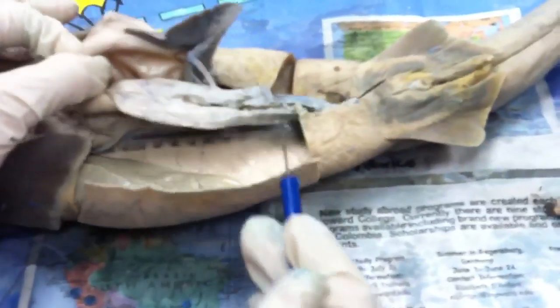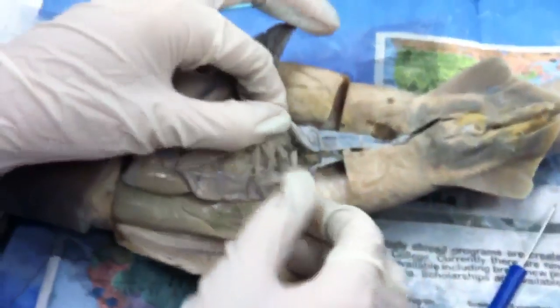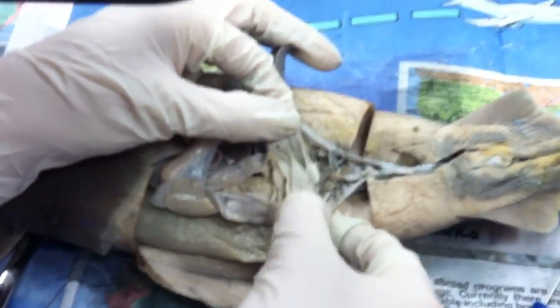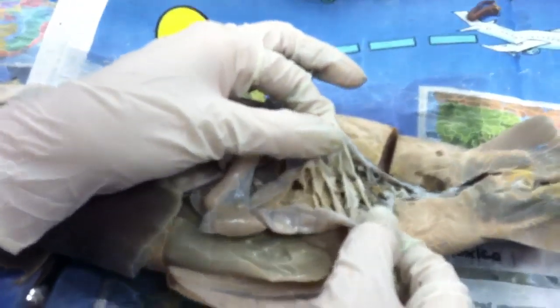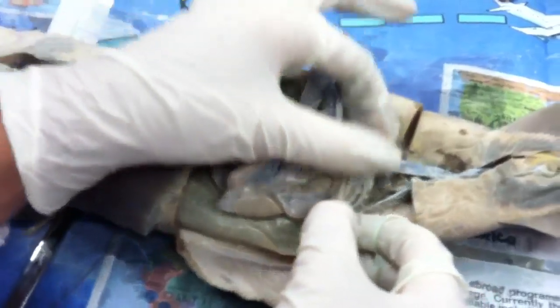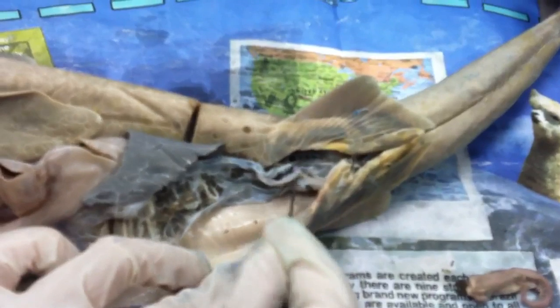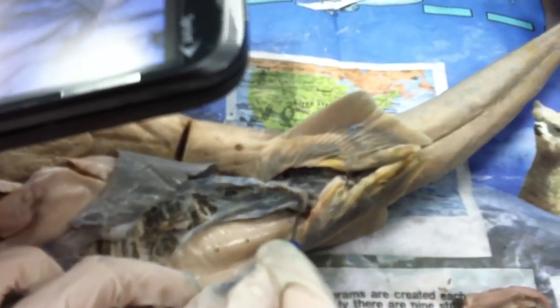Intestine — this is all intestine here, it's called ilium. What is this called? Spiral valve — it's all blue stuff. You see how when I pull it, it's like lines, like a spiral? That's the spiral valve. Colon is all the way down here — that's the last stop before waste exits.